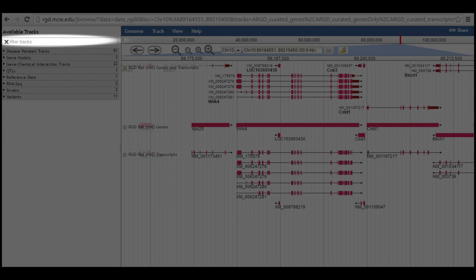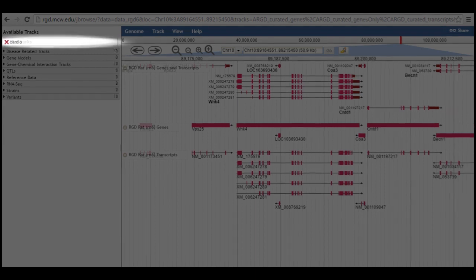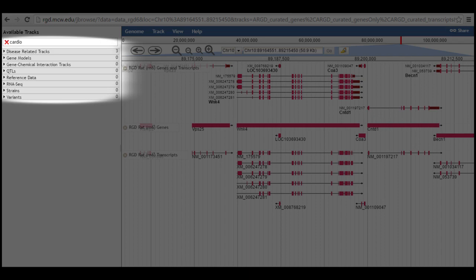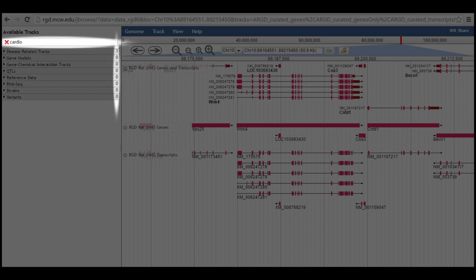The filter tracks boxed at the top of the page lets you enter a term, such as cardio, and the list of available tracks is then limited to the ones that match the filter term entered. In the case of cardio, the available tracks are reduced to three disease-related tracks, making it easier to find the tracks you want.